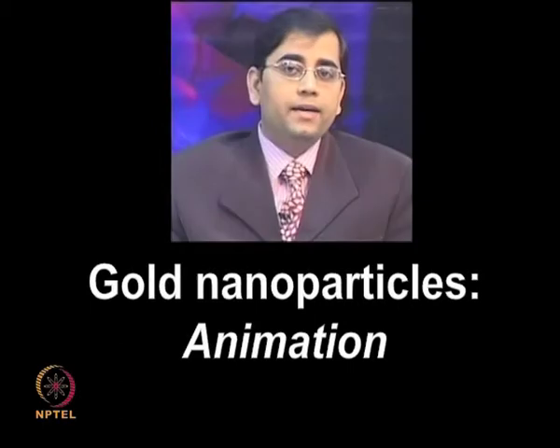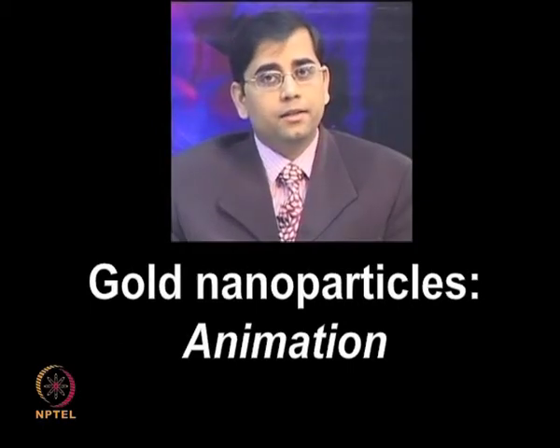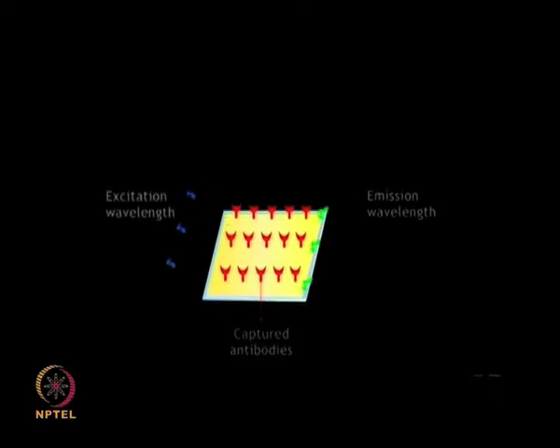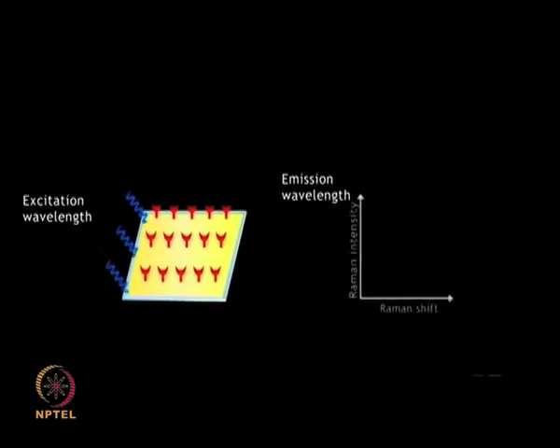So, let us now look at the principle of using gold nanoparticles in this interactive animation. The gold nanoparticle surface is functionalized suitably by antibodies, which will bind to the analyte of interest. Any target binding is depicted by a change in the emission spectra.